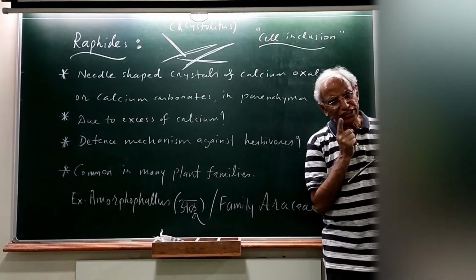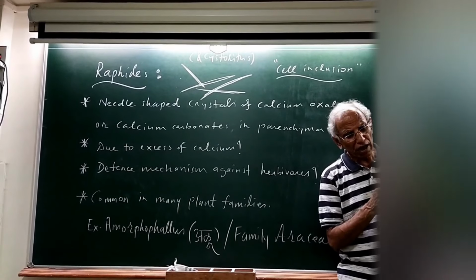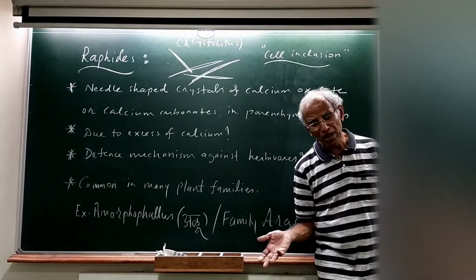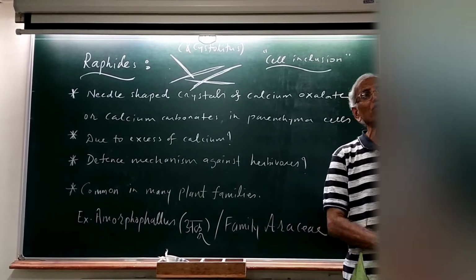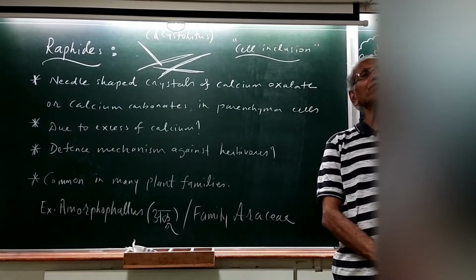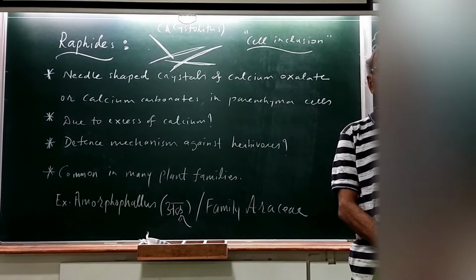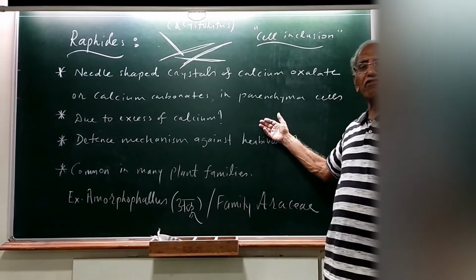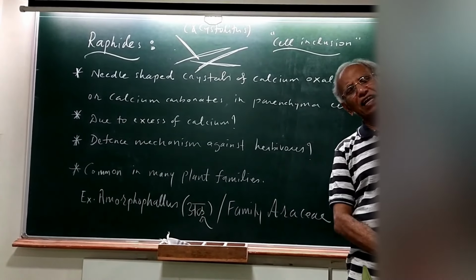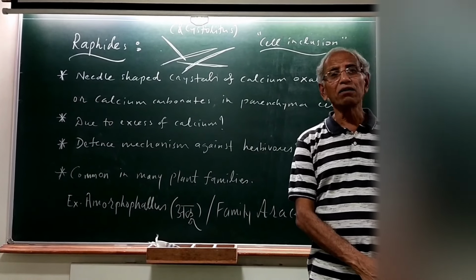What we will do is we will take a section of this petiole, because this is the stalk of the leaf, and then we will see parenchyma cells, and in the parenchyma cells we will be able to see the raphides. And in the case of the petals, the parenchyma also has big vacuoles which have pigments like anthocyanin, and similarly many of the parenchyma cells are quite possibly storing some excretory waste. Now, to call this excretory waste will be objectionable by many of you, but usually they are classified as excretory wastes. Let's go for making the slide and observing it under the microscope.